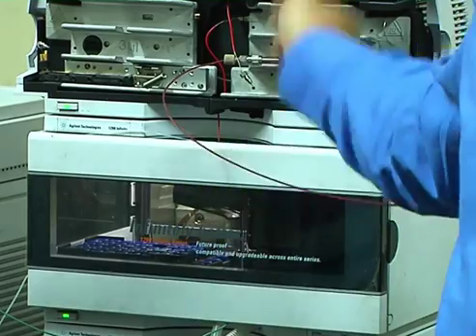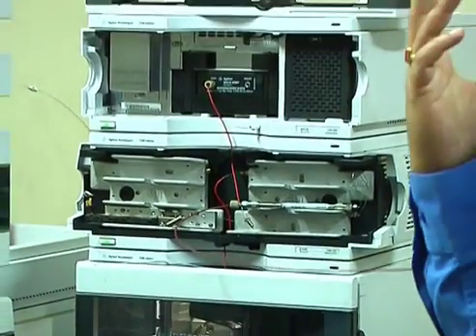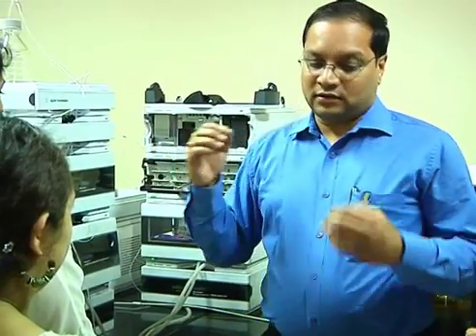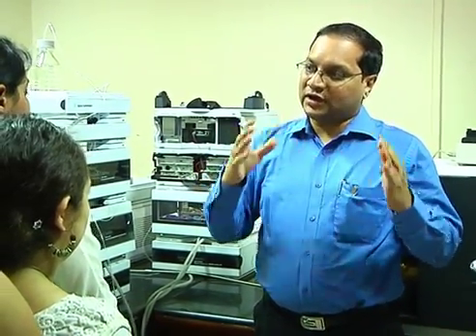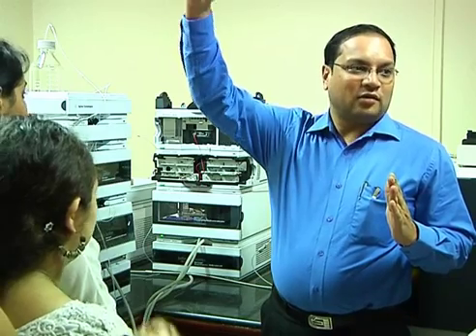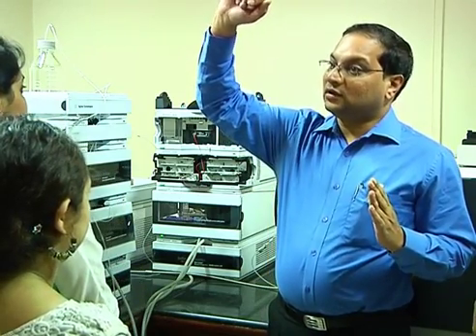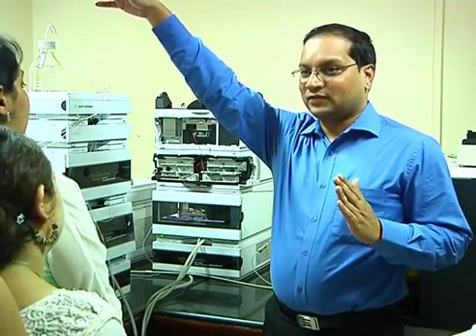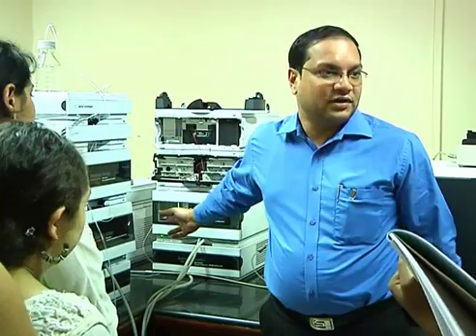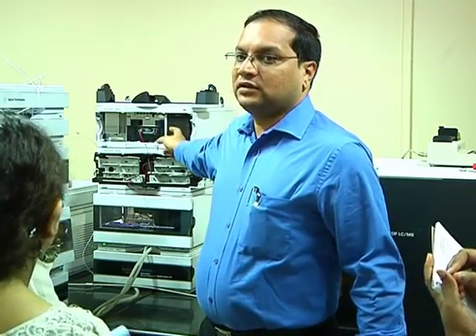You can put hundreds of samples in that, define your runs, and carry out your other work, and by the time your analysis gets over, it is automated. But what I mean to say is, if you put 100 samples and the time taken to separate is 30 minutes, let us say, by the time the 100th sample comes, it is 300 minutes, isn't it? Or more than that. What it means is samples might degrade by the time their turn comes. So to maintain a constant temperature, you have a thermostat. You maintain the temperature of the samples in the autosampler at 4 degrees Celsius, so that your sample doesn't degrade during the analysis, if you are running automated analysis. And then there is the DAD, that means UV analysis.